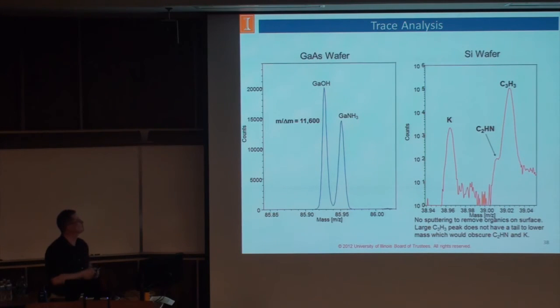One thing about the TOF SIMS, when we're talking about mass resolution, you really have to say what mass you're looking at, because m over delta m is defined for slit-based systems, whereas the time of flight is not a slit-based system, so it actually varies across the mass range. You may have something like 400 at hydrogen, but you're at 10,000 for gold. So when people are writing papers, they'll say my mass resolution was such-and-such at mass 28, or something like that.